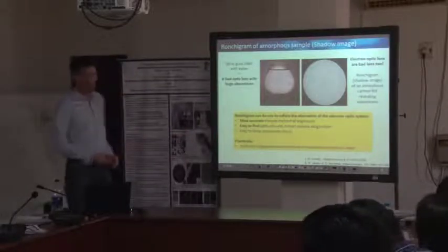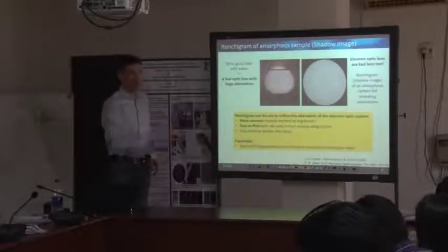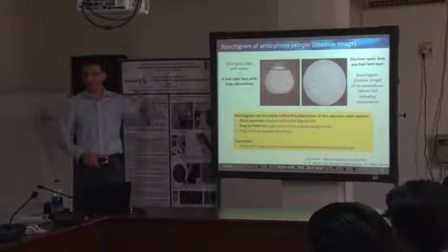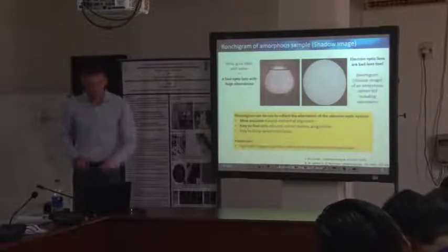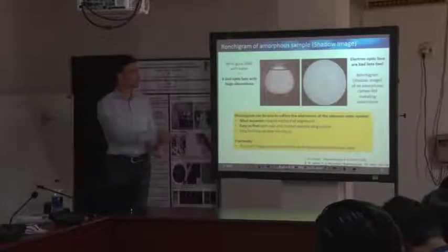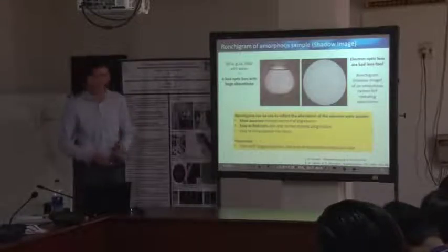We usually start with a large aperture, because then we see all that, and you have to find the center of your Ronchigram. If you are strongly defocused, or your sample might not be, let's say, amorphous, then it helps a lot to start with a large aperture, so that your field of view, or the shadow image, becomes large. So simply that you see more.